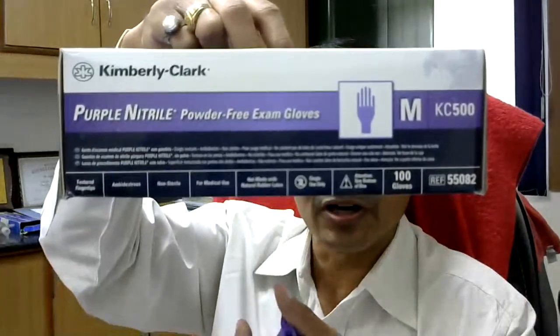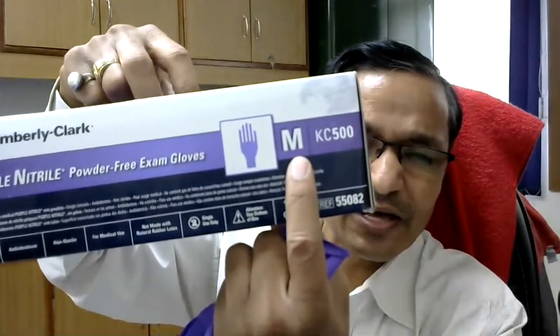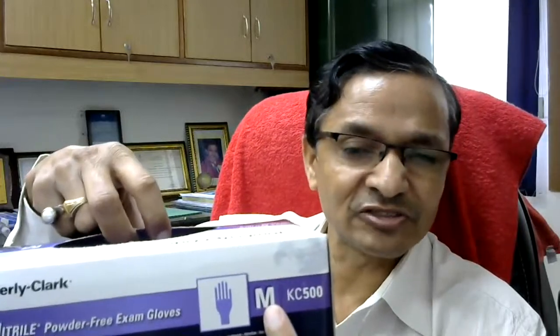So you can see this is the gloves box, and you can see what is written here. M is written, so this indicates that the size of the gloves is medium. If it is written L, then this is a large size glove. If it is written S, it means a small size. So depending on the size of your palm, you have to find out whether large size gloves will be suitable for your hand, or a smaller size or medium size.